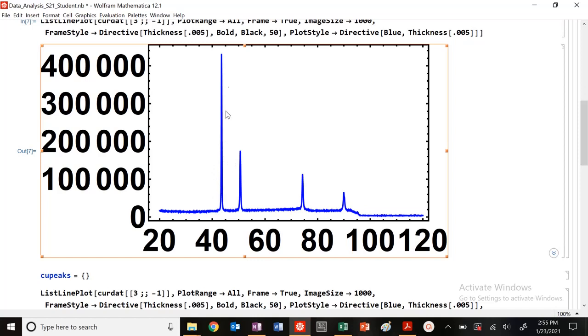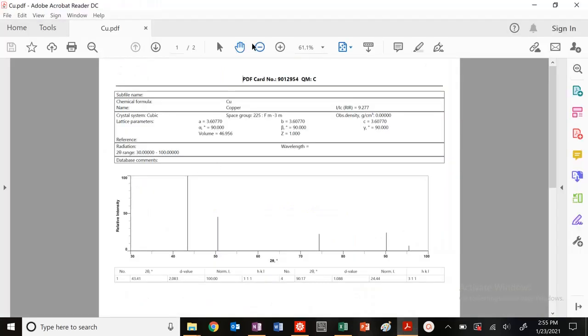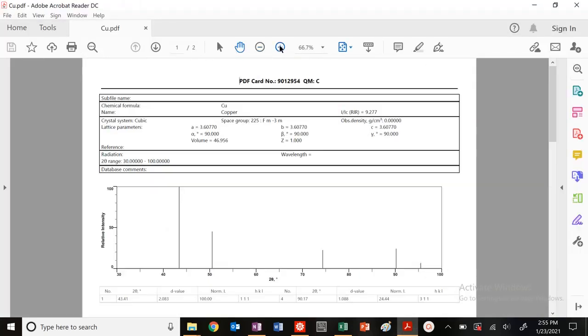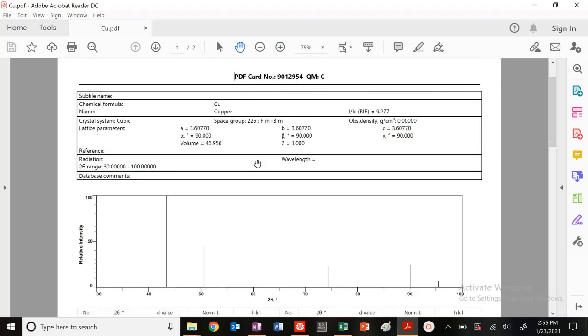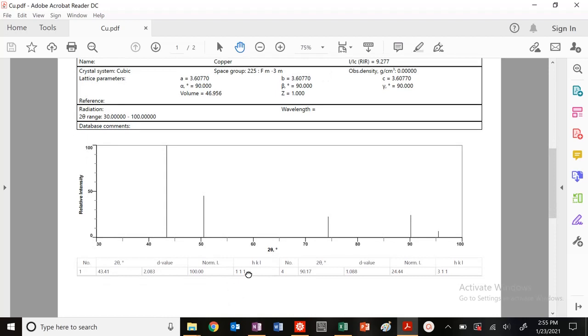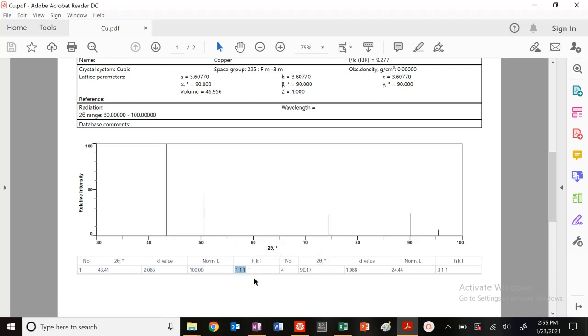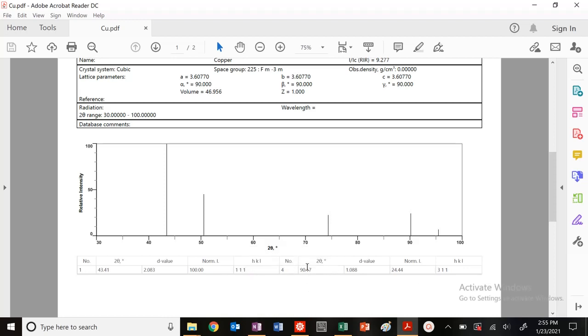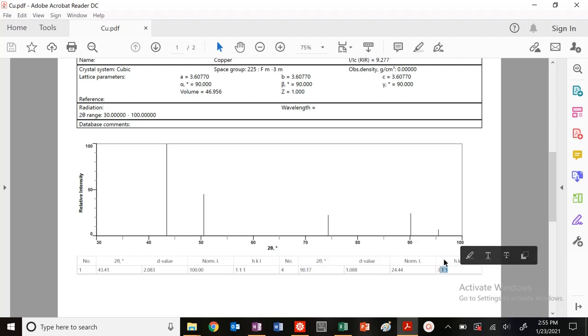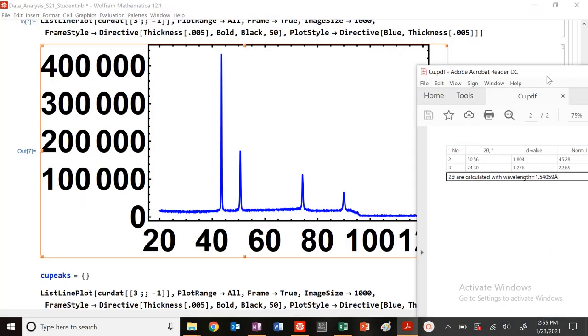This is a nice plot, but what would be really nice is to see how our experimental peaks compare to the theoretical value from our international crystallographic database. These are the theoretical peaks that should be occurring here. There should be a peak at 43.41, which corresponds to my number one peak here. This corresponds to the HKL 111 peak or interplanar distance. For our two theta here, the 90.17, that corresponds to our HKL right here.